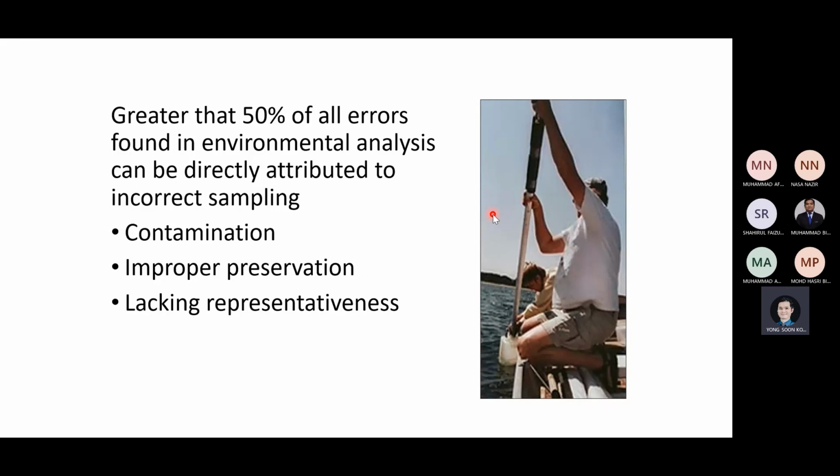That is because contamination or cross contamination will happen all the time. Because the moment you start collecting water sample and you screw cap it, it's already starting changing. You can say contamination in some sort, yeah. Because of this technique, it might cause inaccuracy or the lack of precision in your data. So that is what we're trying to prevent, yeah.